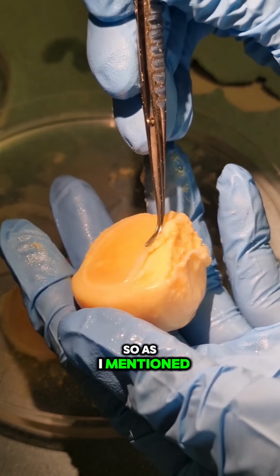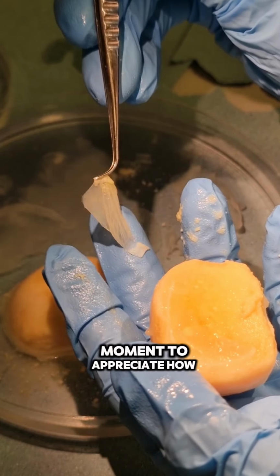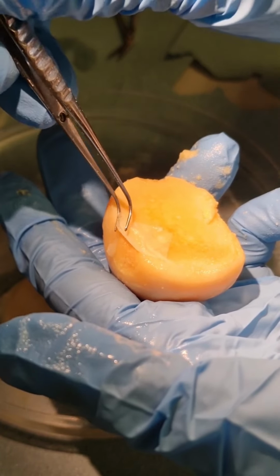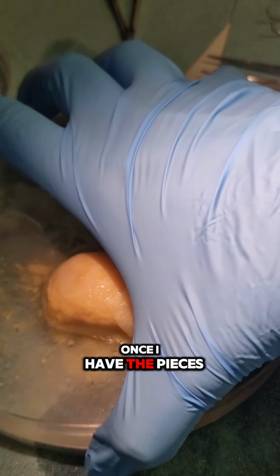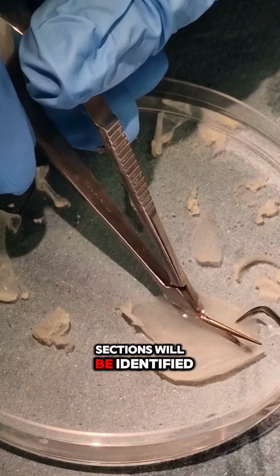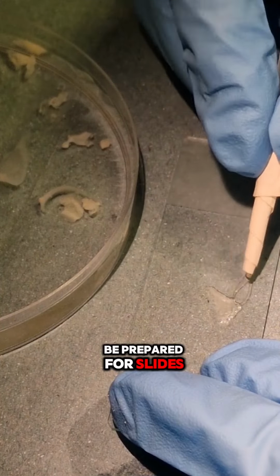Anyways, so as I mentioned, I take multiple sections of this membrane around the yolk. I will spare a moment to appreciate how satisfying these peeling moments were. Once I have the pieces I need, I put the yolks aside and I just look at my pieces. Sections will be identified and cut, and then these will be prepared for slides.